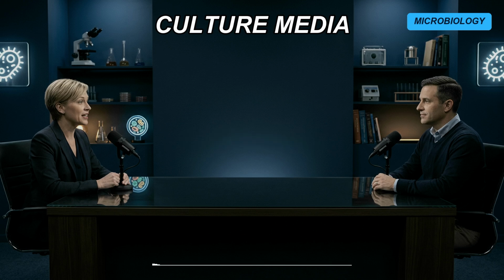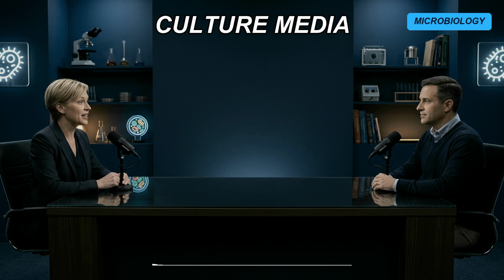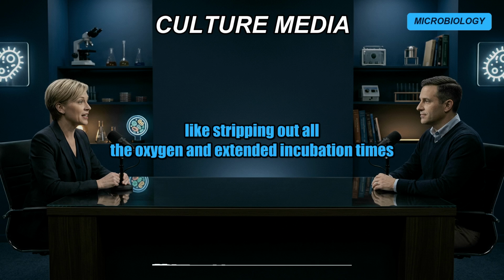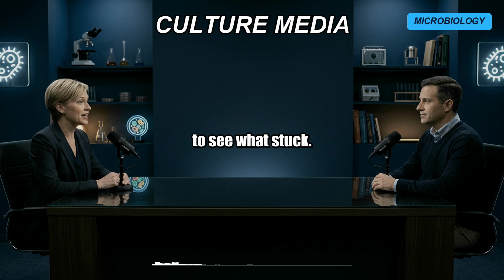Culturomics. Instead of playing it safe and using one or two standard media, they essentially brute forced the problem. They took human gut samples and subjected them to dozens of different media, drastically different temperatures, varying atmospheric conditions, like stripping out all the oxygen, and extended incubation times for months, all in parallel. They just threw every conceivable environmental variable at the wall to see what stuck.